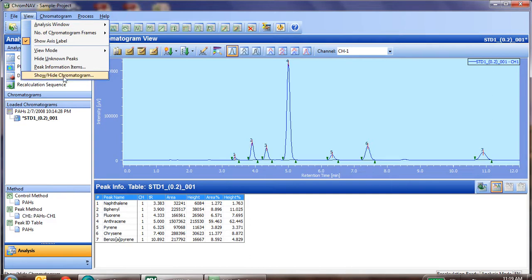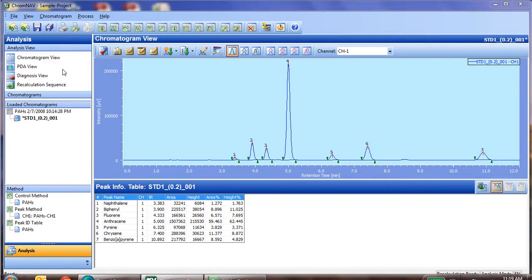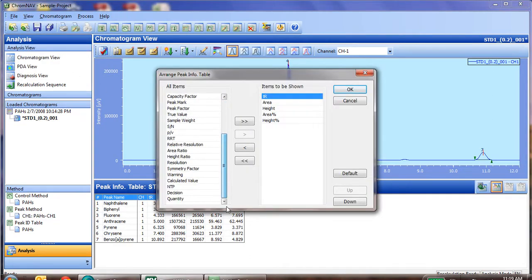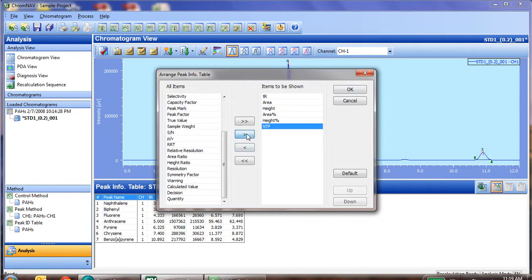So if we go to view, peak information items, and if we scroll down, we'll see we have the number of theoretical plates, which is what we're using to base our formula on, as well as the decision.